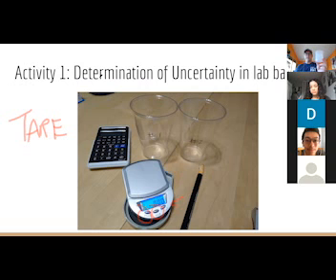Well, you get a beaker, you put that on the balance, you zero it, and then you just start adding sodium chloride till it says 50. It'd be a pain if you had to constantly be doing math, like, what do I need to get to? What's the math? So to avoid that, you just hit tare. That's all that means. You're just resetting it to 0, and then any additional mass comes from what you've added.